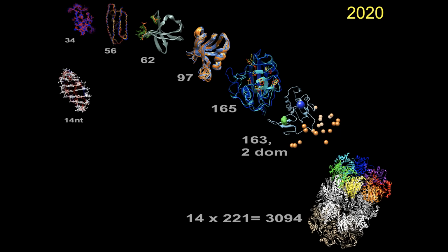We were able to get a couple of distances with reasonable precision. They are not really that precise anymore. You don't get a 0.1 angstrom precision, of course.